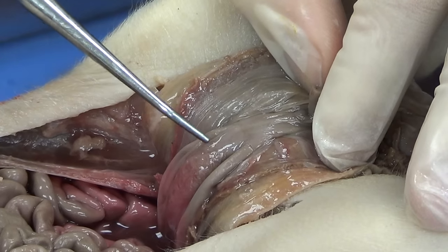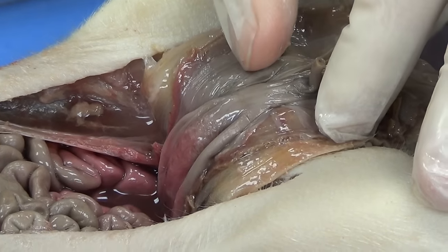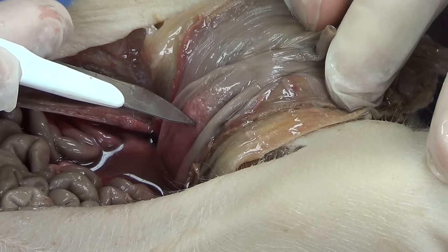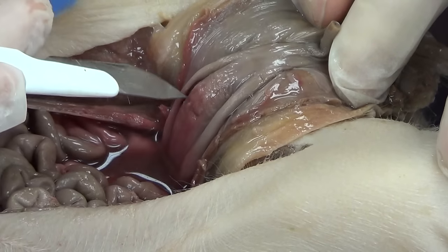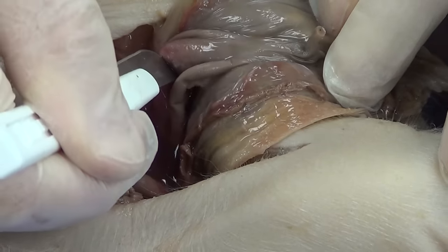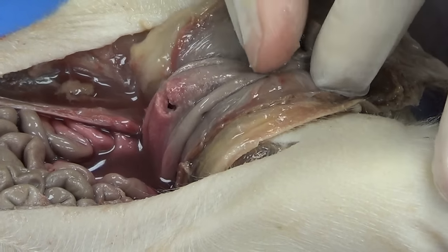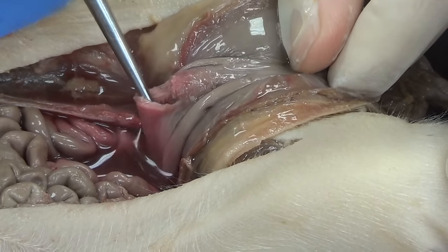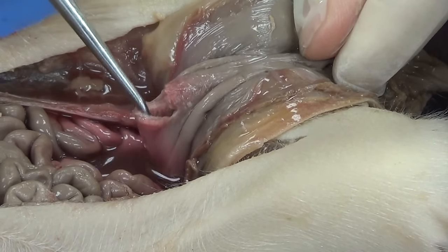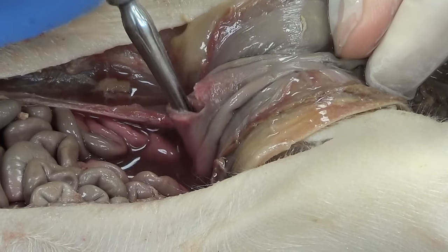This structure right here in the middle is going to be the urinary bladder. I'm going to cut that urinary bladder very gently — not the arteries, just the urinary bladder. The urinary bladder is muscle, so it's going to require a little effort. I'm going to open that up and stretch it out a little bit, and you can see that it is a muscular container. That is the urinary bladder.